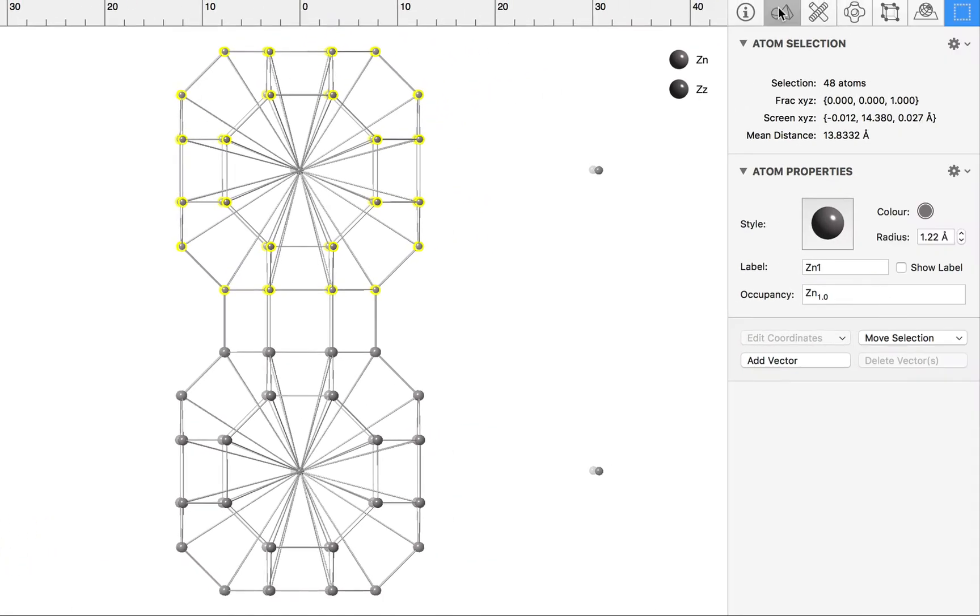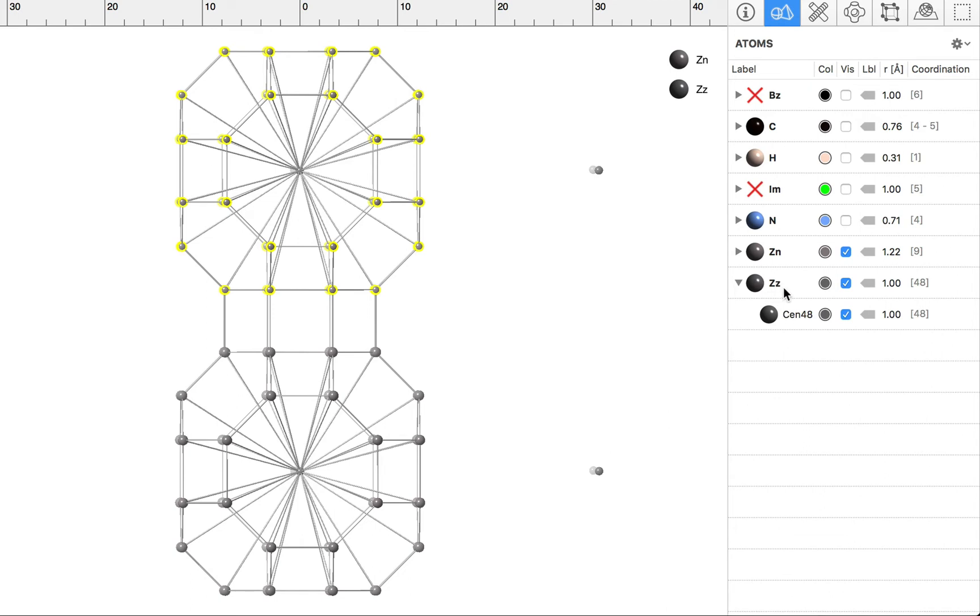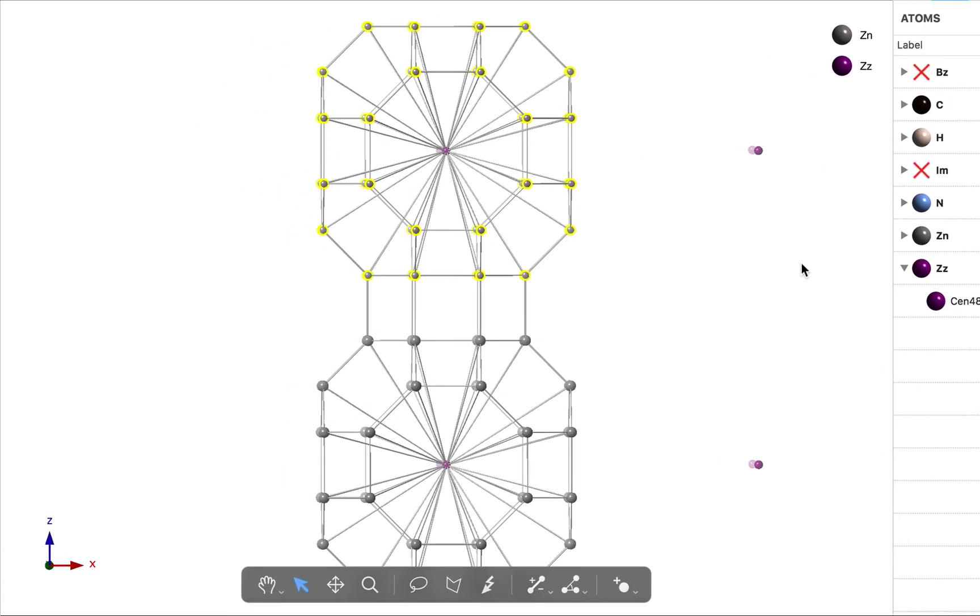And we have our dummy atom in the middle. I can go to the atoms inspector, and here's our ZZ element. And this is our site, CEN48. Let's just change the color of that. Let's make that a slightly tasteful shade of magenta, and we can see that there. Now let's have a look at the connector.